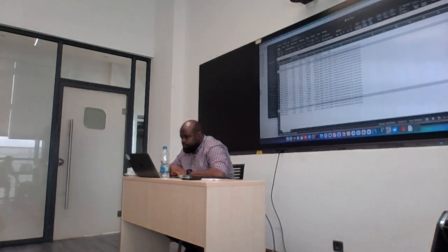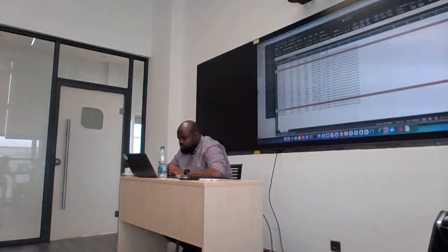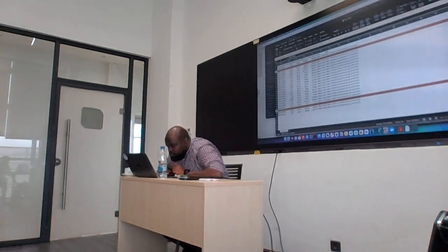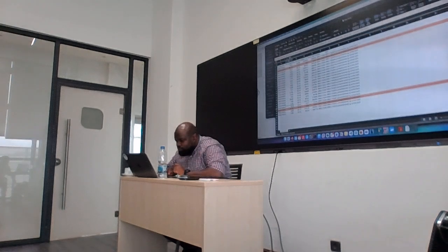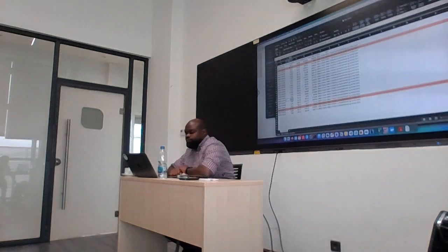These two, correct? There's one even with 58, that is 847. Oh, yeah. There is one with 38%, that is 880.